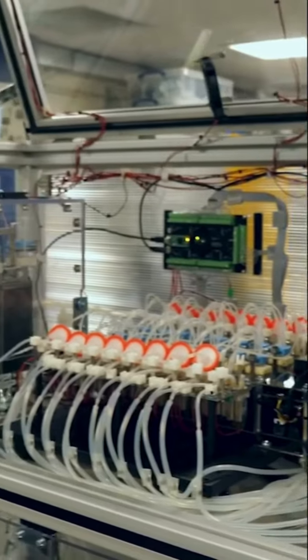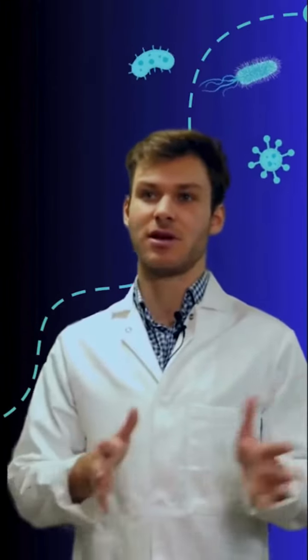The machine is like a long-term evolution machine where we can basically grow microbial cultures for very long periods of time, and at the same time we can control very precisely the environment in which they grow. We hope that by doing this we can steer the evolution of these bacteria in the way we want, and we can also investigate the way they are evolving with respect to the environment.